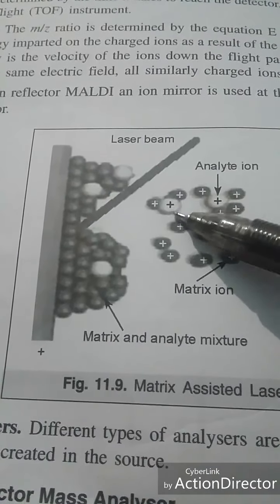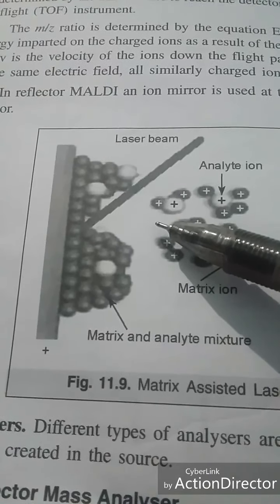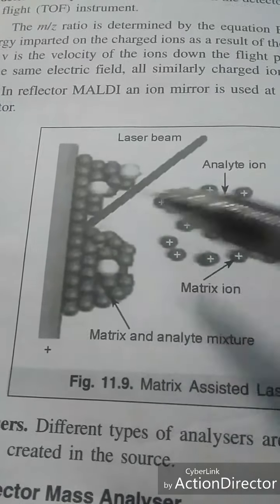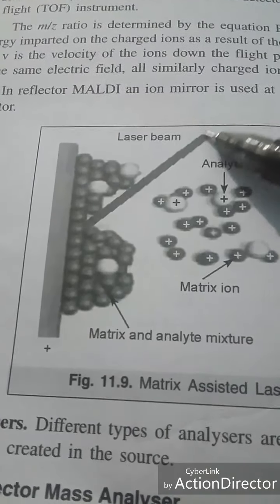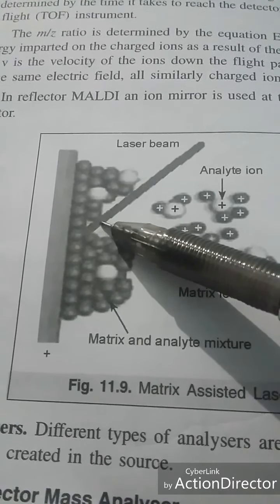This is the matrix-assisted laser desorption ionization technique, also known as MALDI. It can be used in two modes, either the linear mode or the reflector mode. In this technique, the sample is bombarded with a laser beam, generally a nitrogen UV laser beam.